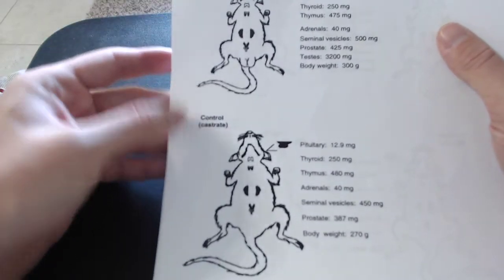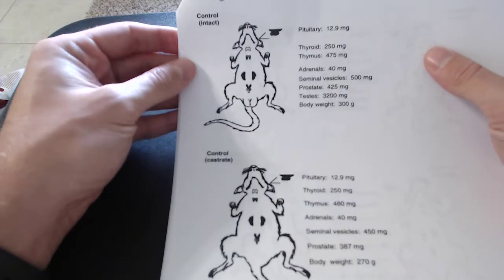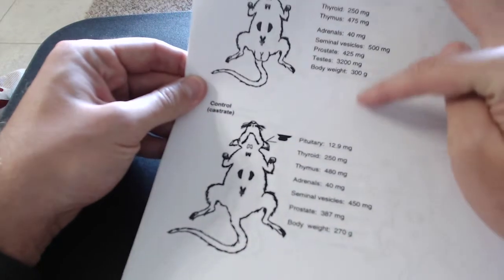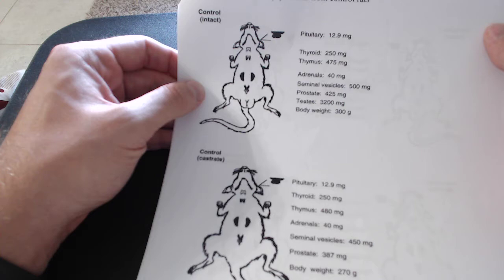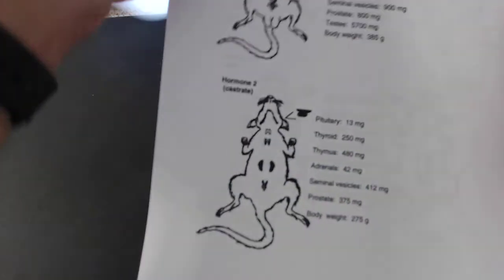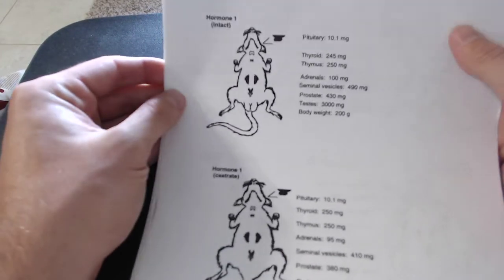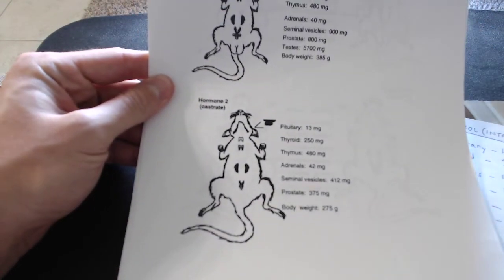The first page you see here is listed as control. These 2 rats were not injected with any particular hormone. The masses of each of those tissues are going to serve as your basis of comparison for every comparison that you do. Then each page after that lists the rats that were injected with a particular hormone. So this is hormone 1, this is hormone 2, and so on.